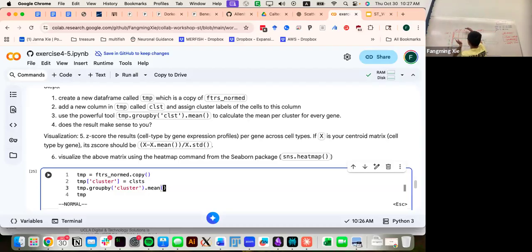Mean just means squash each of these submatrices into a shape like this. When we think about matrix operations, it's always good to think about the shape, how a chunk of data becomes a different shape.